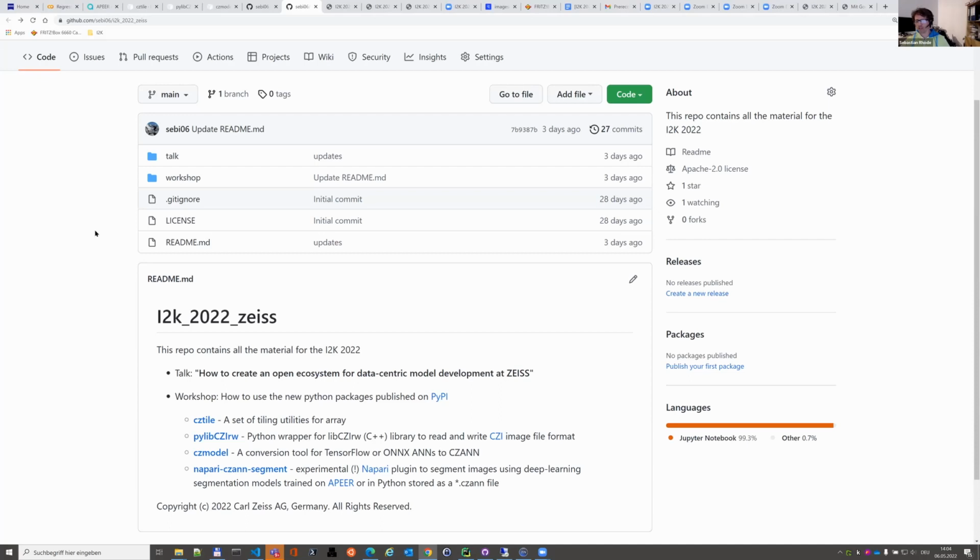But for the sake of this workshop, it should just run, and we don't have to deal with "oh, I have not installed X." We decided to also integrate those Colab notebooks, so we can be more or less sure it will work. So let's start, unless there are already some questions. If there are questions, just speak up and I will try to answer them all.